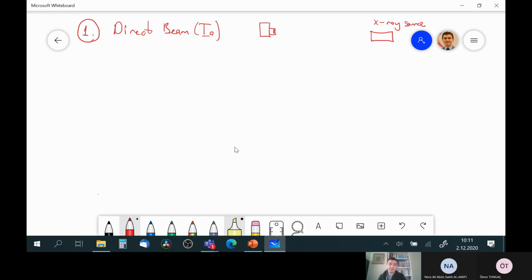And what is the detector scan? We have X-rays produced by the X-ray source, and they come to the active area of the detector. Sometimes the detector position is not correct. Let me show you with different colors. So the detector is staying here, for example. Or sometimes the detector is staying here.